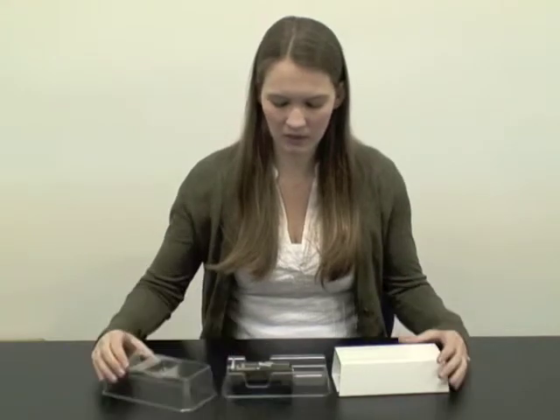The Microshot is a convenient device for making precise, repeatable manual injections, and it comes in five fixed volumes. The Microshot comes in a cradle with a dust cover and an instruction manual.